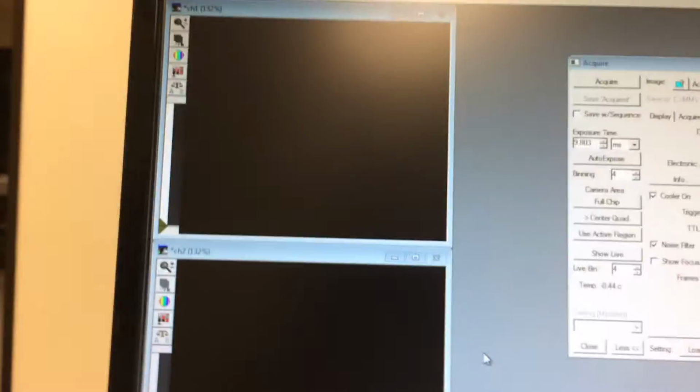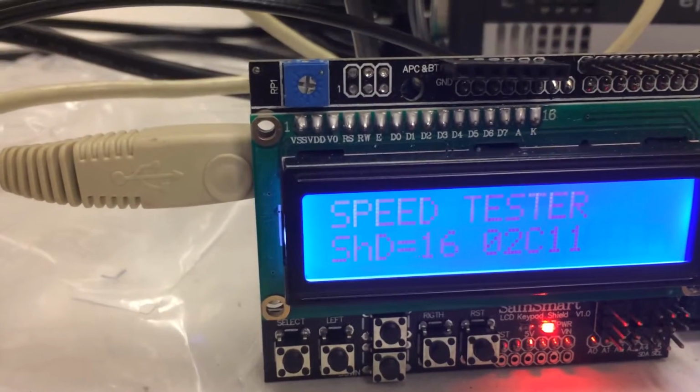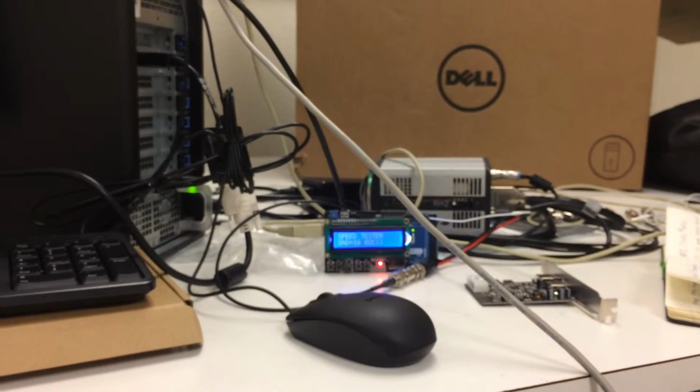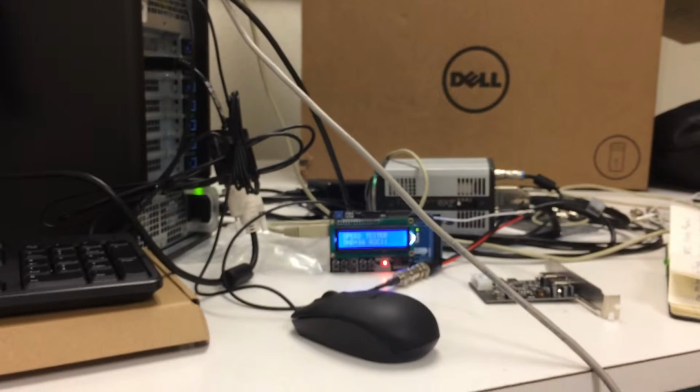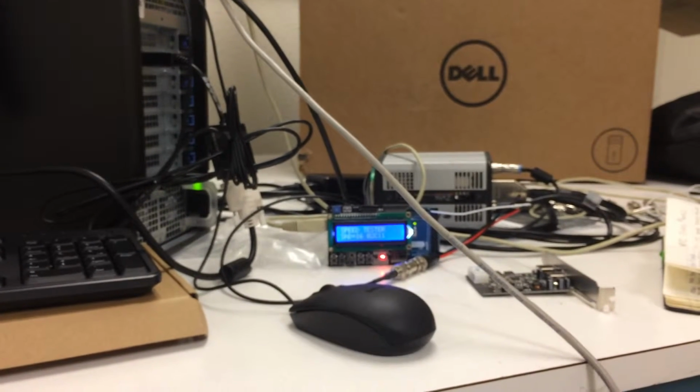So here we're going to say go 100 frames, and we can see that my camera exposure is 11 and my shutter exposure is 16 milliseconds. So that I would ascribe to a delay related to, if anything, my code inside my little box there. But that's the way these systems should work in terms of high-speed synchronization of the device.